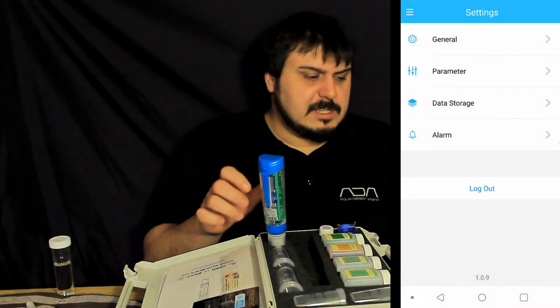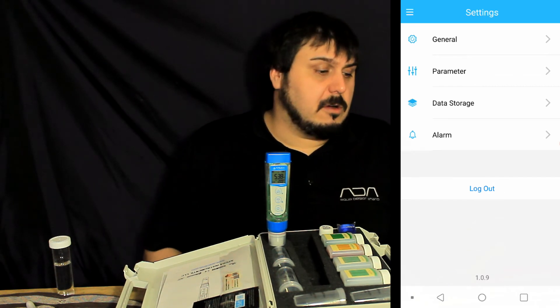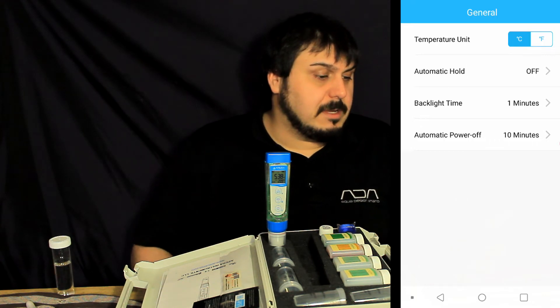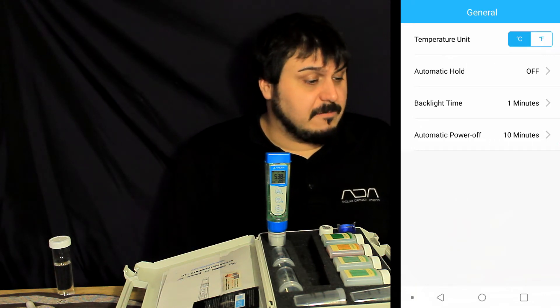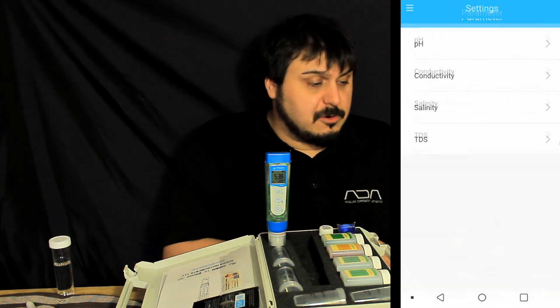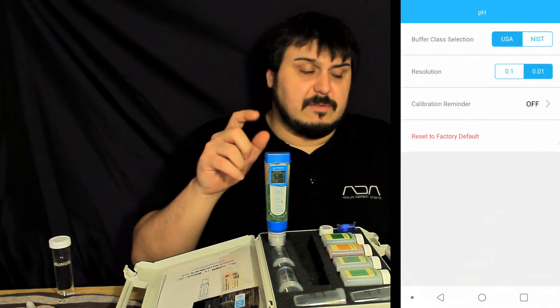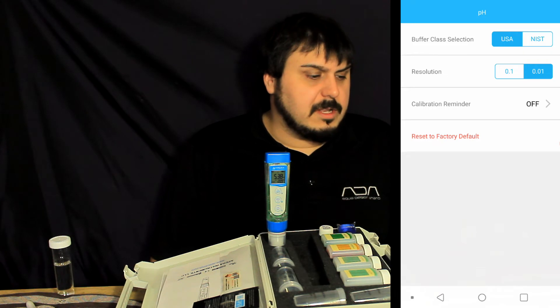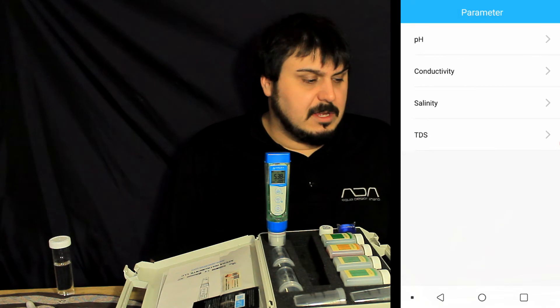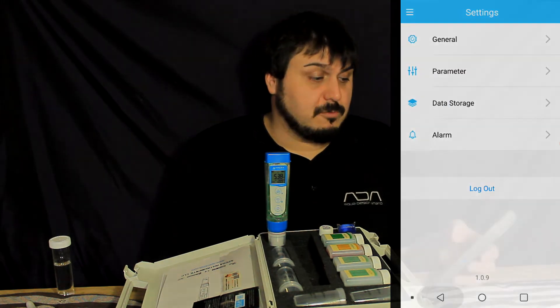The other thing I wanted to show is how to program the pen. You can program everything simply from your cell phone. I like the ability to change temperature from Celsius to Fahrenheit, set automatic hold and backlight, program how long before it turns off, and adjust each of the seven settings individually. For pH you can change it to different settings, set calibration reminders, conductivity — basically everything you need to program this pen can be done from your phone.